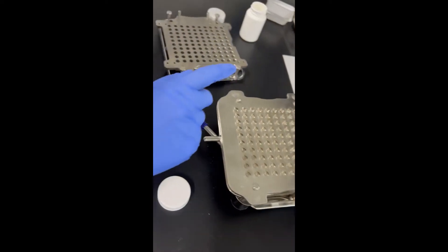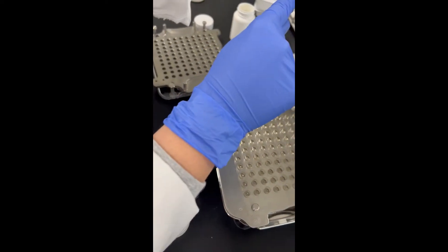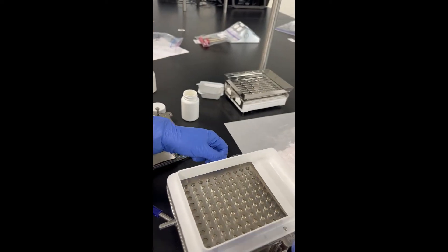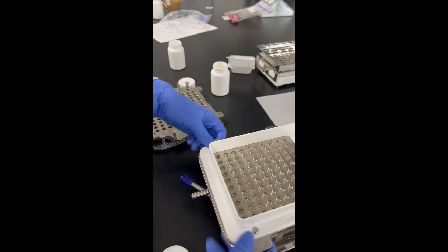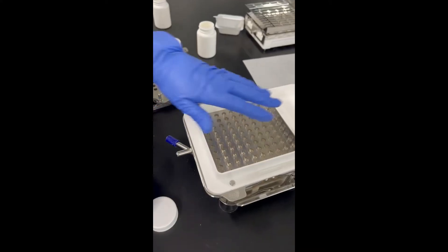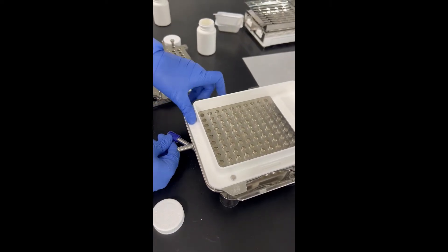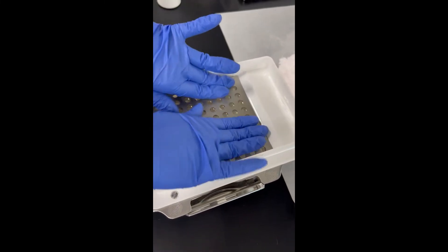Once you get that, go ahead and grab this piece — it's the one that says Pro Filler — and it's just going to place on the top, pointed towards you. Press it down just a little bit. Once you get this white piece on, go ahead and let go of the lever and push it back inside towards the machine, and it'll make all of your bottom halves of the capsules fall down.